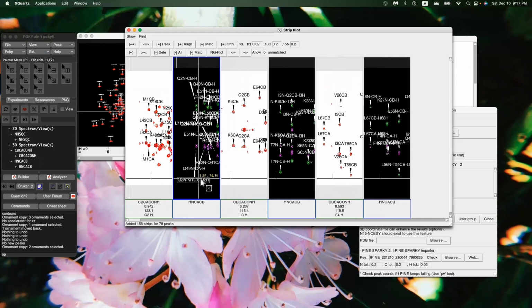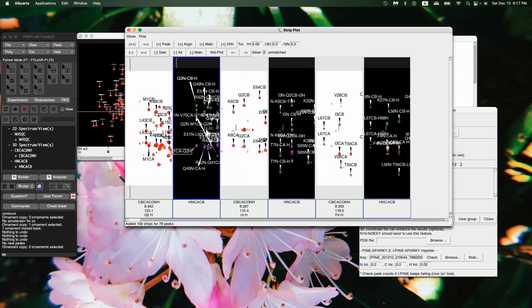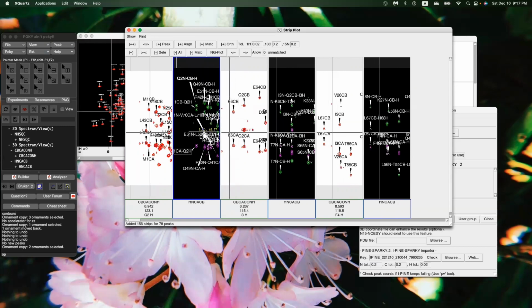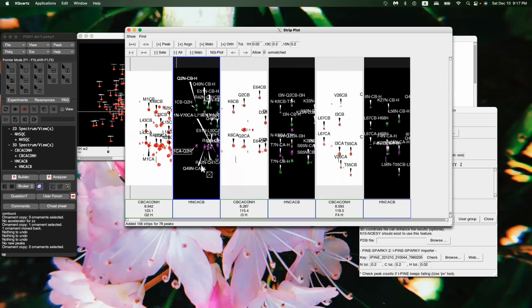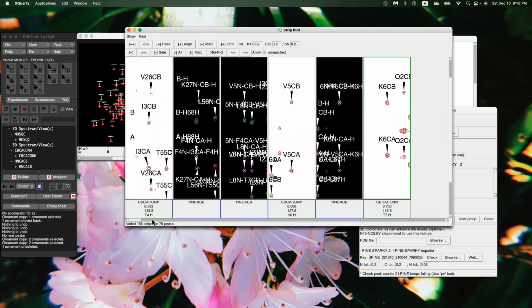It's a little bit difficult to see, but it seems that is it for these two plots, and it looks okay. So we can delete these two selected, and then you just continue on.